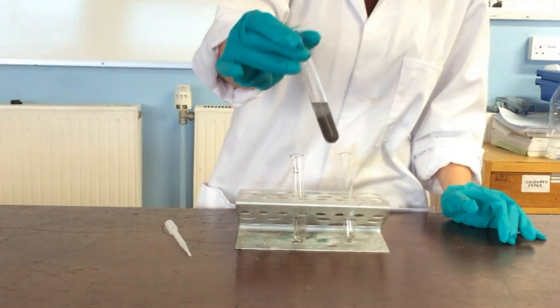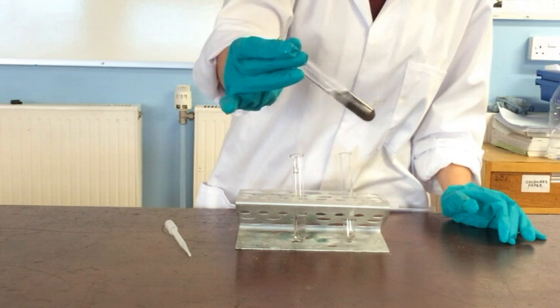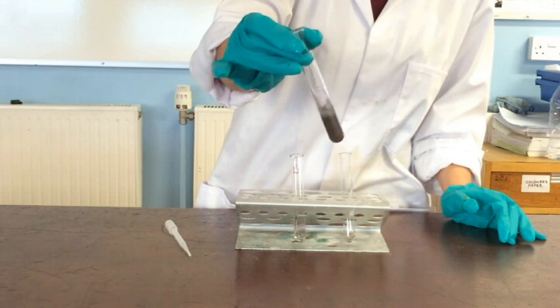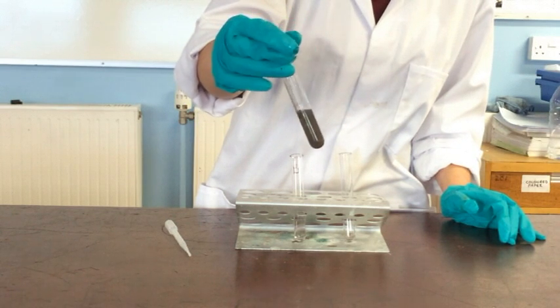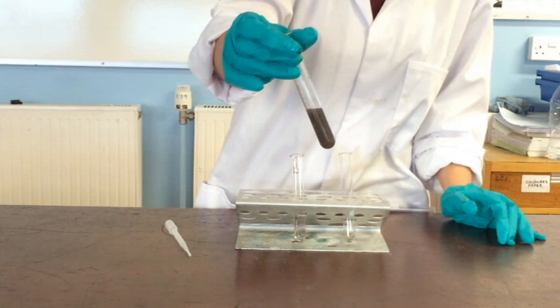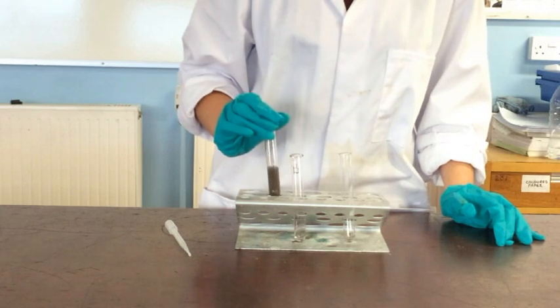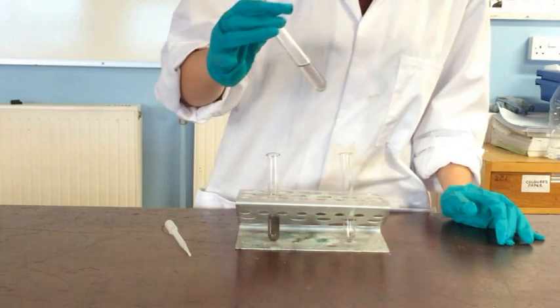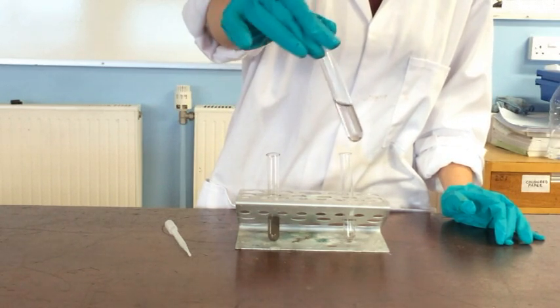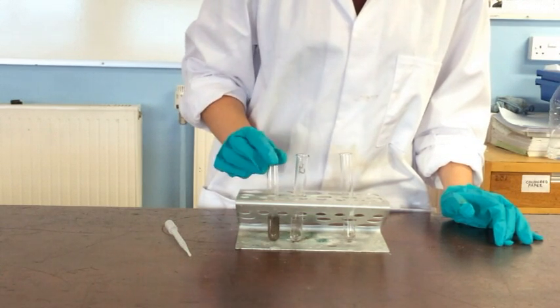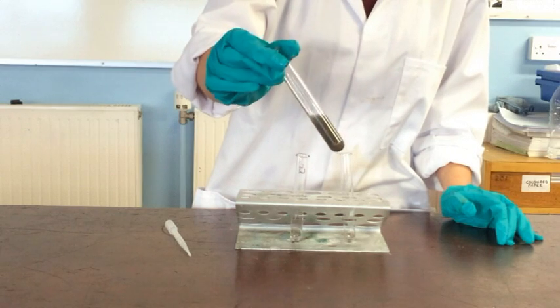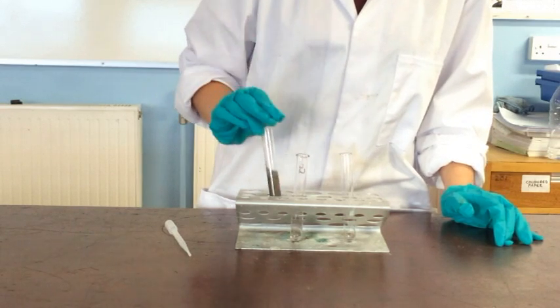Now we can see that A has reacted. It's not quite the silver mirror effect that we wanted but it's definitely a reaction. And you can see there that B hasn't reacted, that's still clear. So B is our ketone and A is our aldehyde.